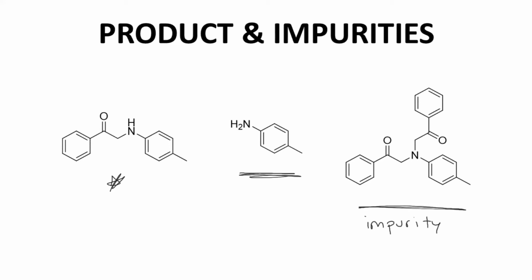on the far right. And what we see is our nucleophilic nitrogen has attacked the bromoacetophenone not just once, but twice. And that certainly can happen in SN2 reactions at times, especially with things like amines. So that is not a surprising impurity to see. Again, I'm not going to go into all the evidence, but I'll have a separate video that'll be linked in a card off of the screen where you can see that information if you're interested.